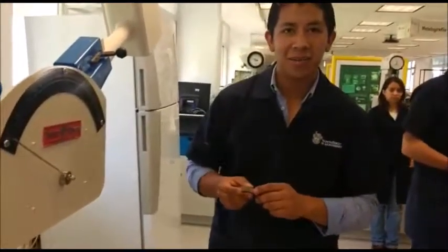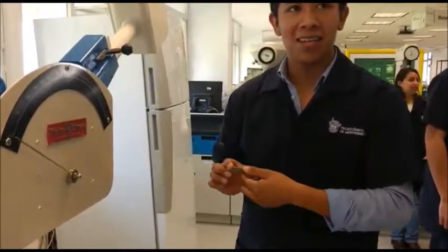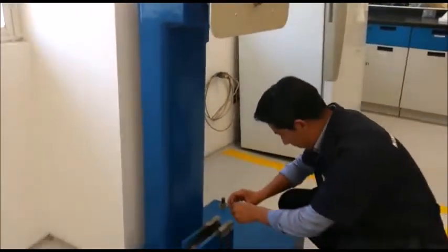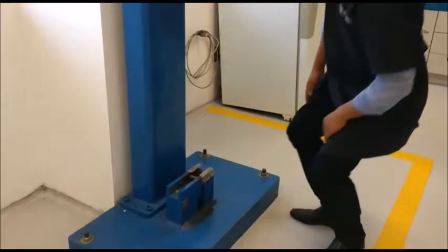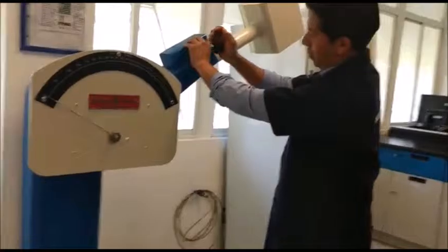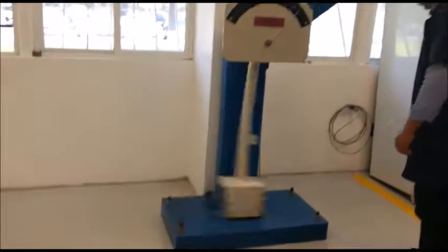Now, here we have our last sample, and we are going to look at this new testing.